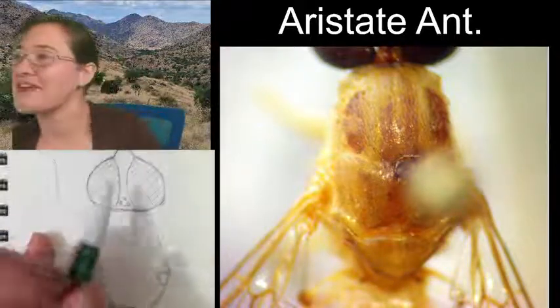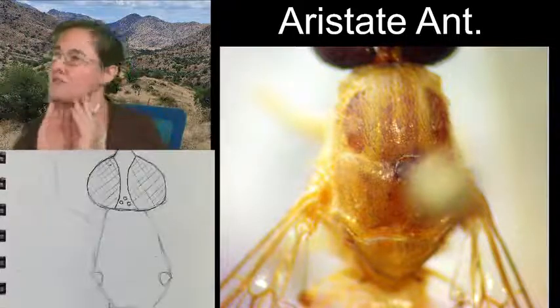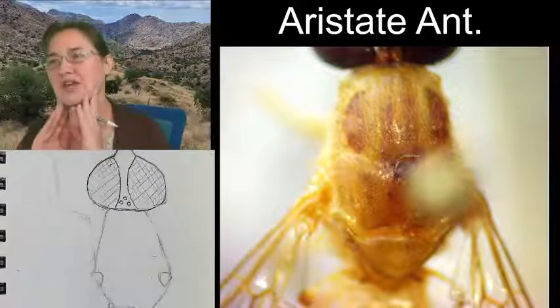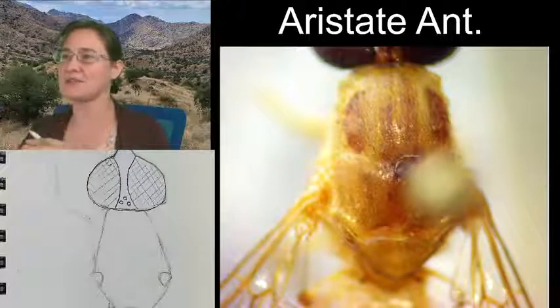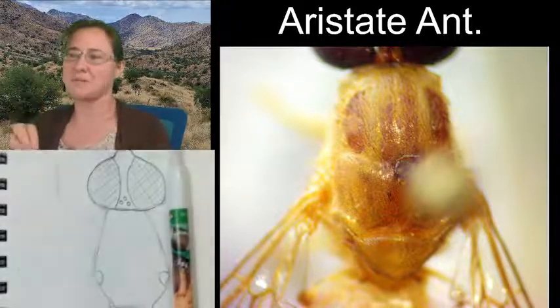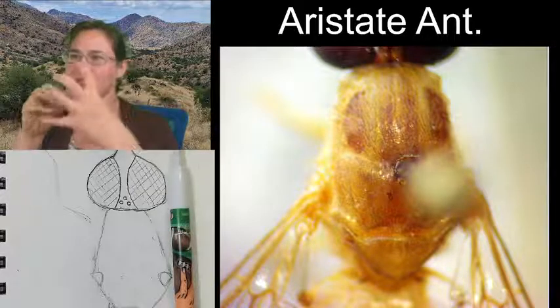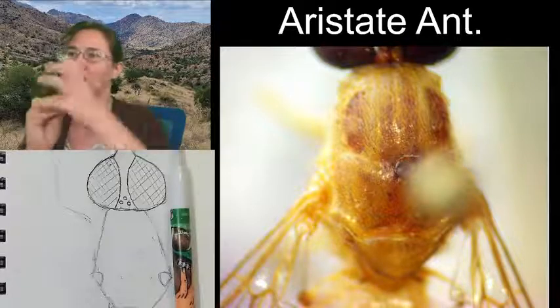Yes. All right. So we also, as you know, or if you've seen flies move around and shake, they have very, very mobile heads. Some of them even have a stalk that comes out of the thorax and then connects to the head so that it has this kind of movement.